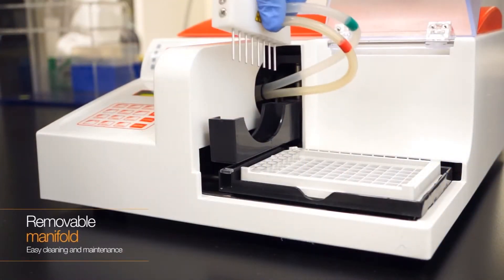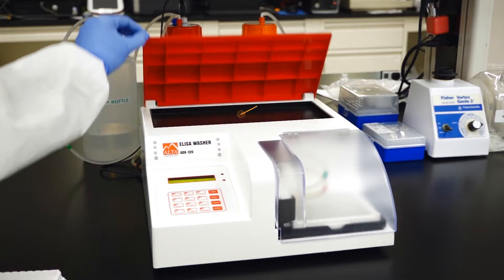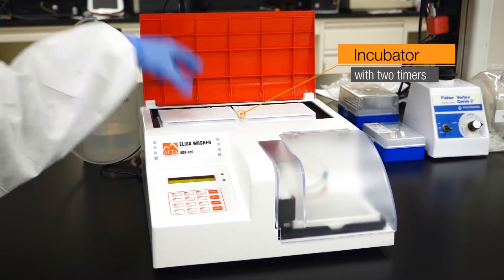The washer's manifold can also be removed and placed in an autoclave to be disinfected when needed. The washer also contains an incubator with a temperature sensor and two timers, allowing you to incubate two plates simultaneously.